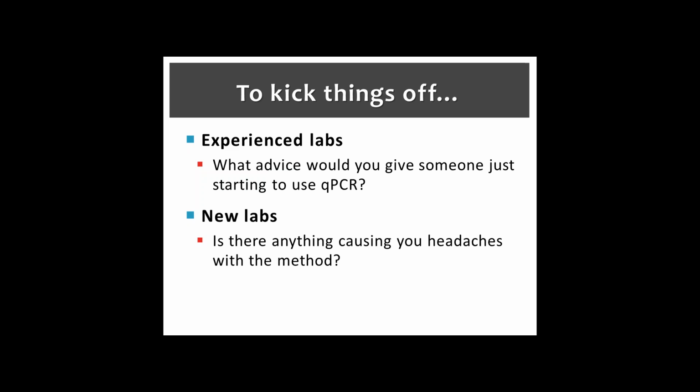Great point. And I think we had a question. Shannon, we did all the filter and freeze this summer, and I have all my QPCR results, but I'd say 80% of mine are like 10 or less. So you still want me to run all those samples through just to make sure that they're coming out right? Because we don't have a lot of dirty beaches. I guess it's yay, but not real helpful when we're trying to.